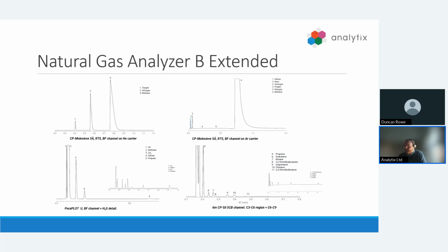And here you can see bottom right hand side that hexane eluted within 50 seconds, octane eluted in approximately 3 minutes, and nonane takes approximately 5 minutes to detect. So this is showing you a nice analysis of C3 to C9 components, where propane can be analyzed on both those channels mentioned, sort of as a bridging component for the two.